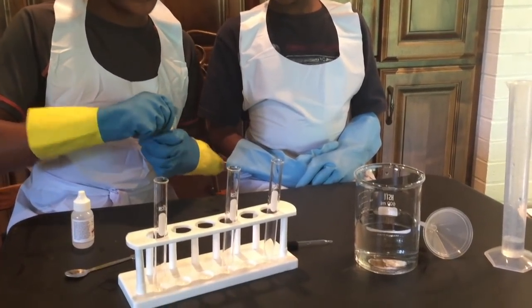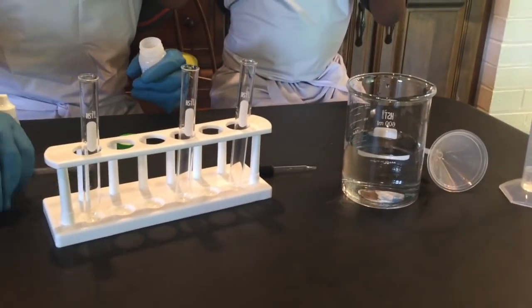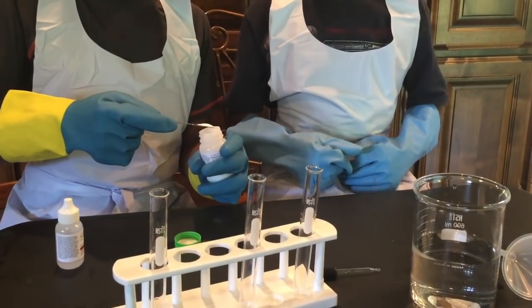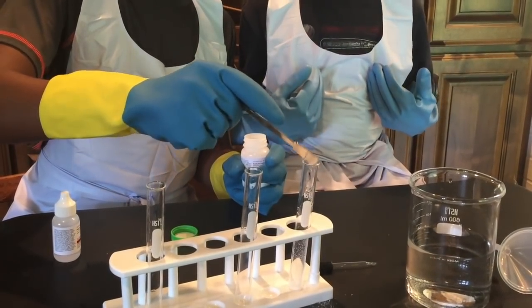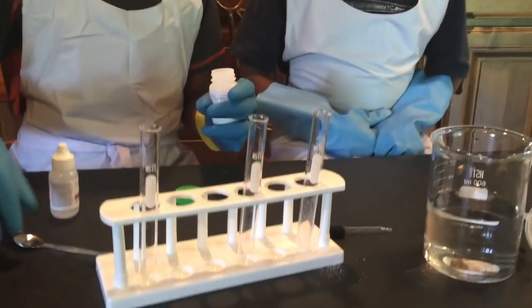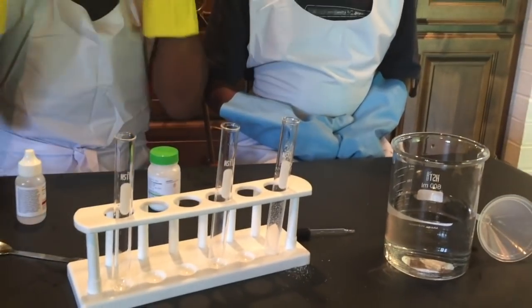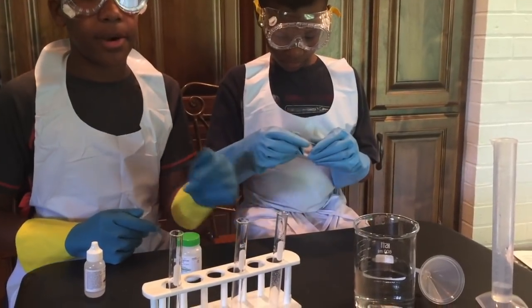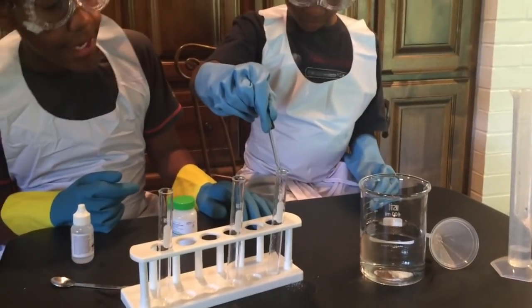We're going to start off by taking some of this chemical and putting it into our test tube. Make sure you have safety gear: goggles, gloves, and a safety apron.